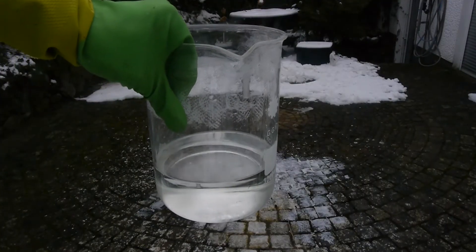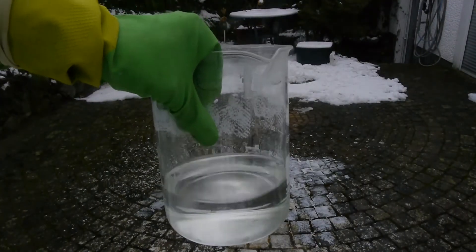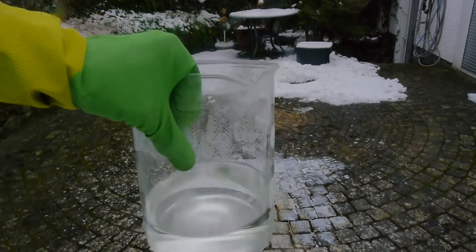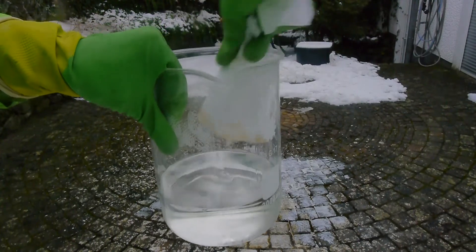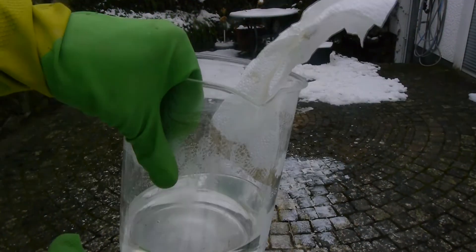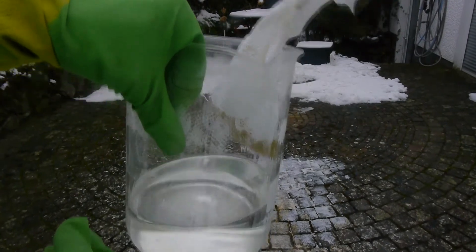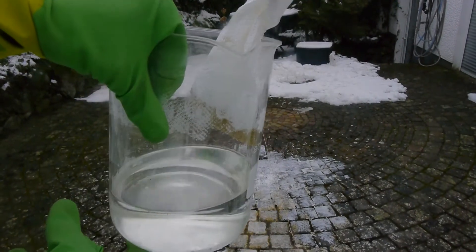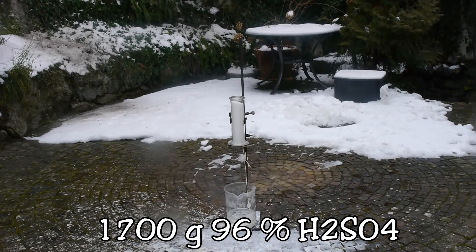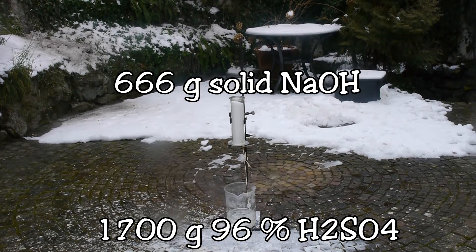Now for the grand finale: 1,700 grams of concentrated 96% sulfuric acid. Watch what happens when I put some paper in there — this is the real deal. This is 7 orders of magnitude, or 10 million times stronger than the acetic acid we started with. Here we go — 1,700 grams of 96% concentrated sulfuric acid with 666 grams of pure sodium hydroxide.